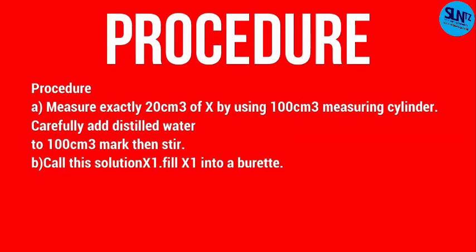This is the procedure you are supposed to perform. Then stir that solution to make it a homogeneous concentration.